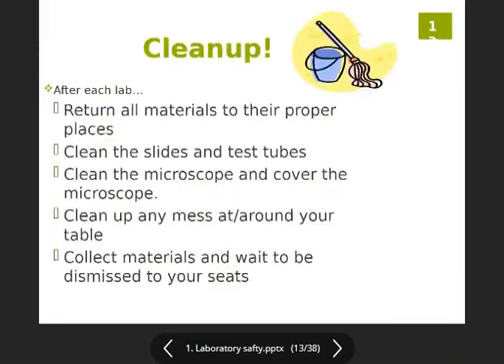After you finish your work, the most important thing is to clean the place, only your place. I am not talking about the whole lab, but your table, the place where you're working. You need to clean all the slides and test tubes, because the next group is coming and they don't know what you have done. So this can hurt others. So for your safety and for others, you need to clean your table before you go.